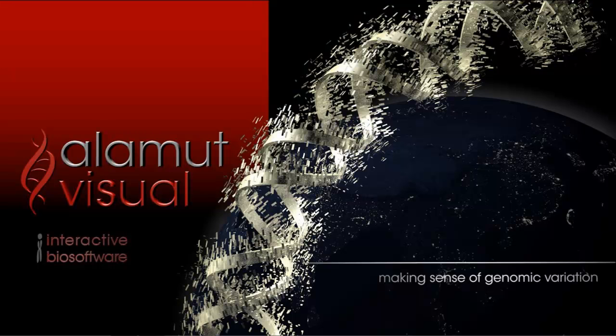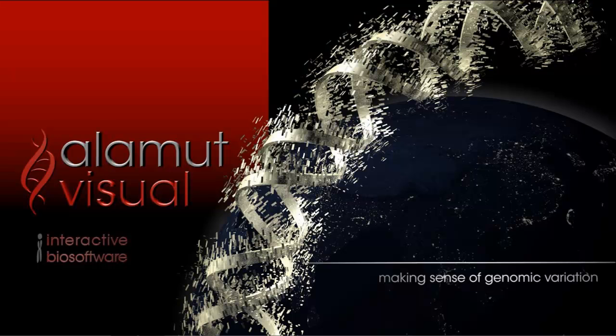Interactive Biosoftware offers the most comprehensive solution for variant clarification, interpretation, and reporting on a single interface. Alamut Visual is a mutation interpretation software designed to help scientists interpret human genome variants.